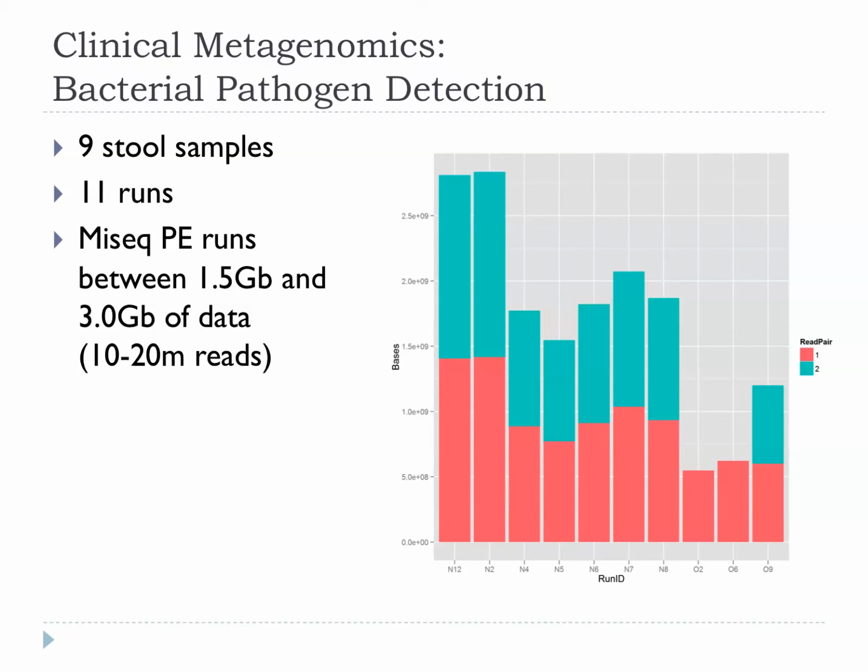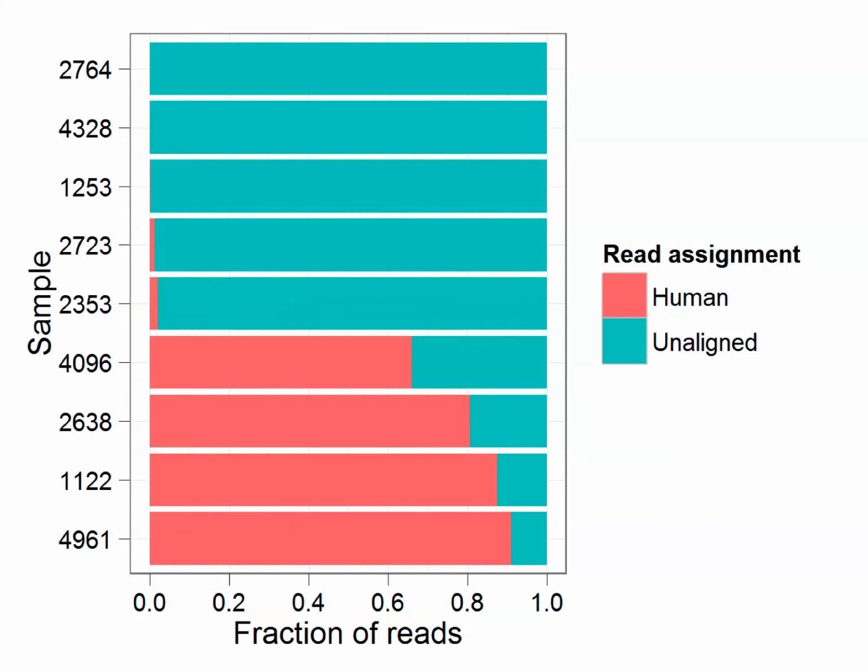Now, we only just got the MiSeq a few weeks before. This is all just working out of the box, no optimization. We just wanted to see what would happen. Would we get any useful information? Would it work at all? We had no idea. And interestingly, when we looked in the literature, we could only find one paper from a Japanese group where they looked at two stool samples to do this kind of thing. So it's kind of weird that nobody else has thought of doing it.